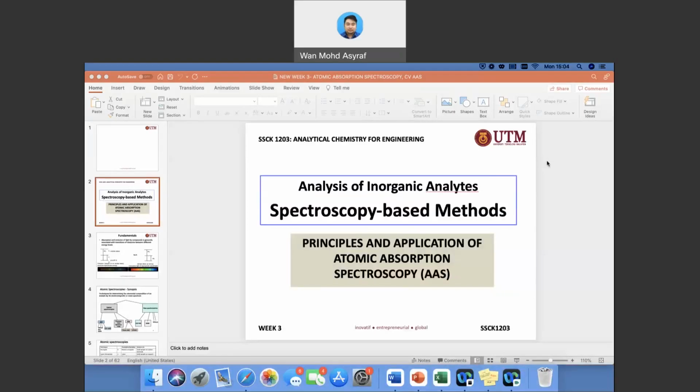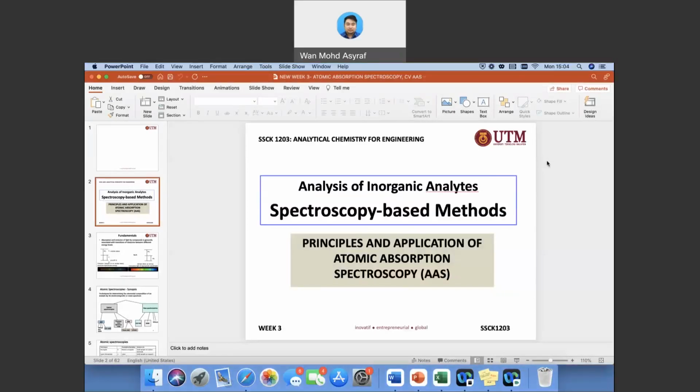Okay, hi everyone. So now I will continue on the third chapter for our syllabus, which is the principles and application of atomic absorption spectroscopy.